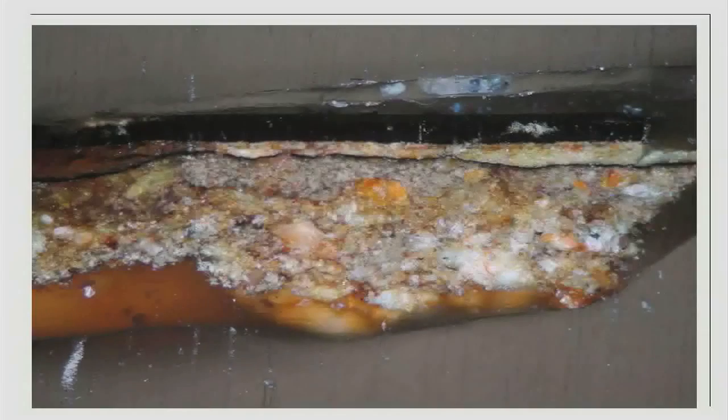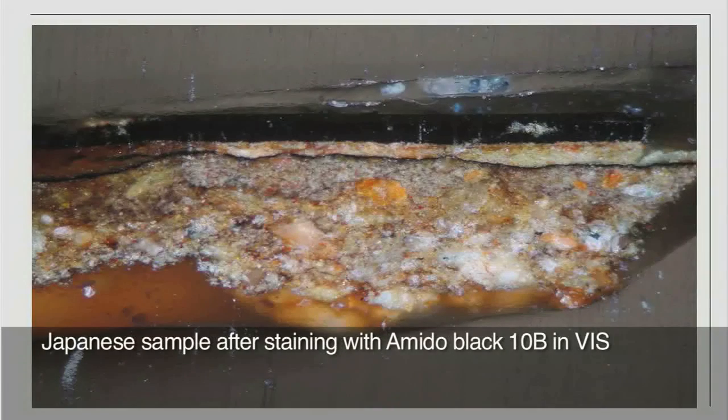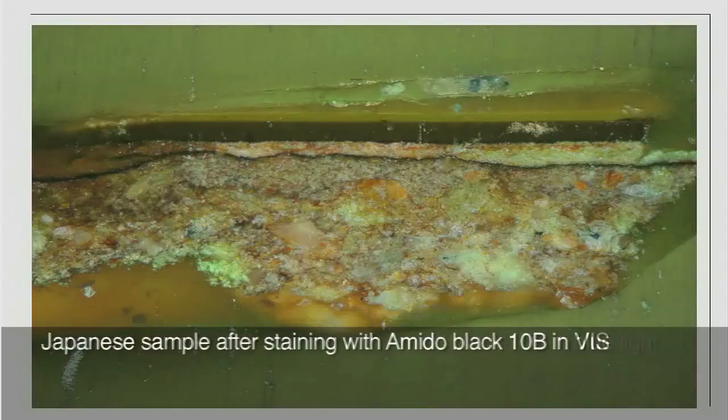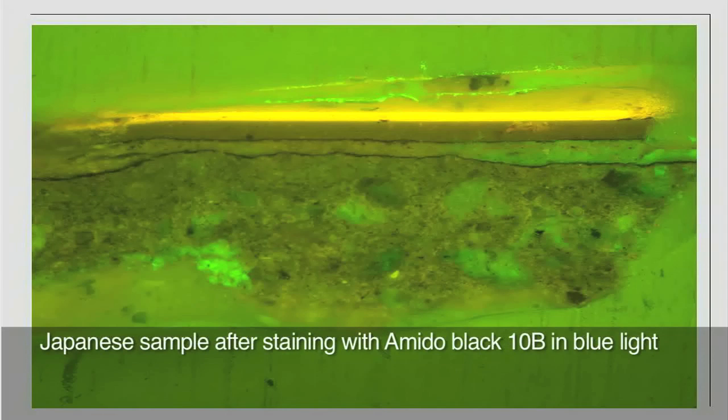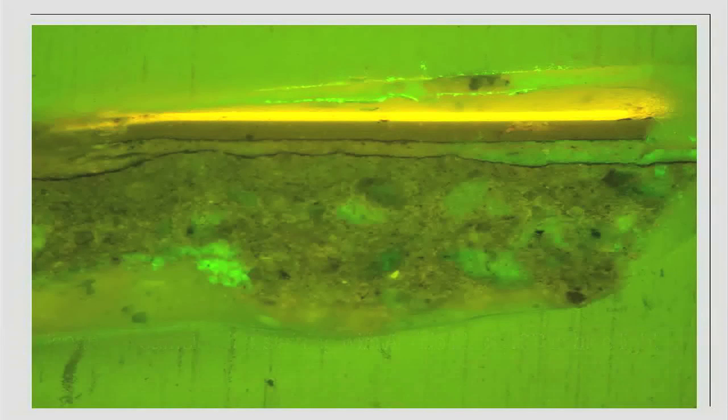The staining result is now checked with a microscope and is shown in this picture. In blue light, protein stained with Amido Black would have appeared as very dark or almost black areas in the sample. These are clearly not present here.